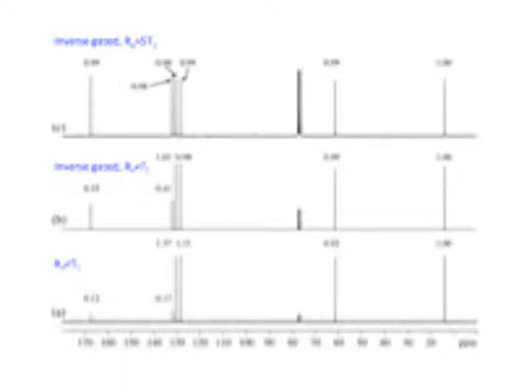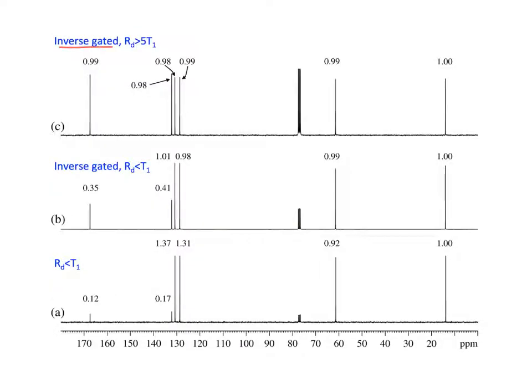All right, so the top example here is the inverse gated with a long relaxation delay. And notice that the signal intensities are the same, right? So we could integrate this if we wanted to. Huh? Yeah, that's chloroform.